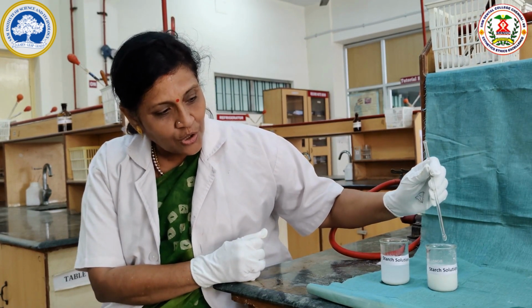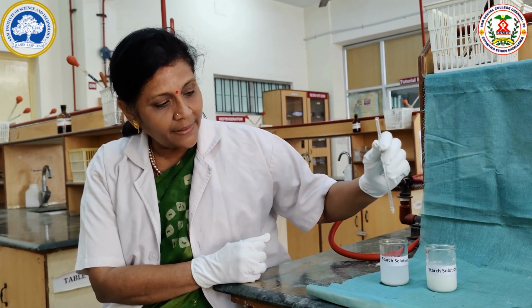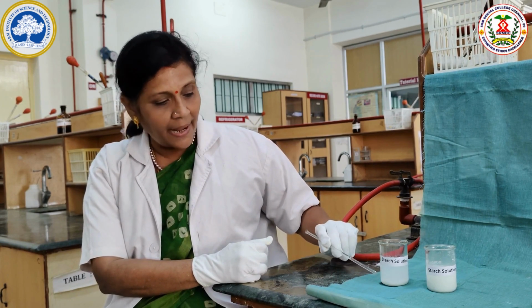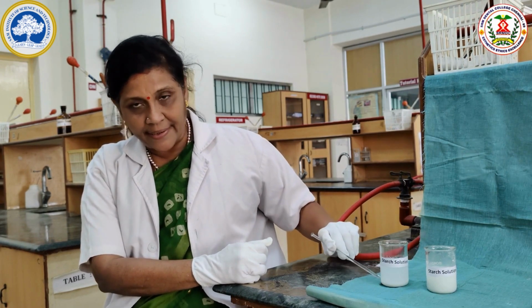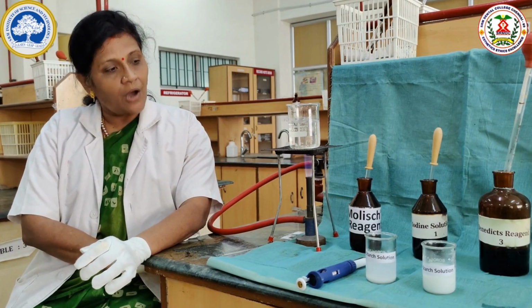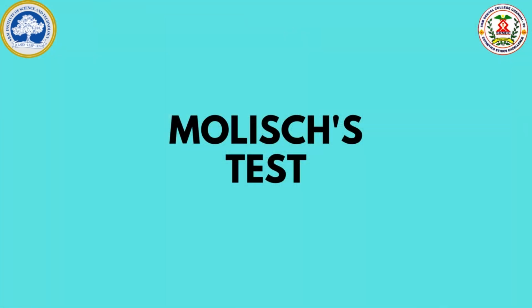So this is starch solution. Starch is insoluble in water. We can see it is turbid. This solution is after settling for some time. The soluble component is amylose. The insoluble component is amylopectin. We will perform the test to prove that starch is a carbohydrate, polysaccharide and non-reducing.